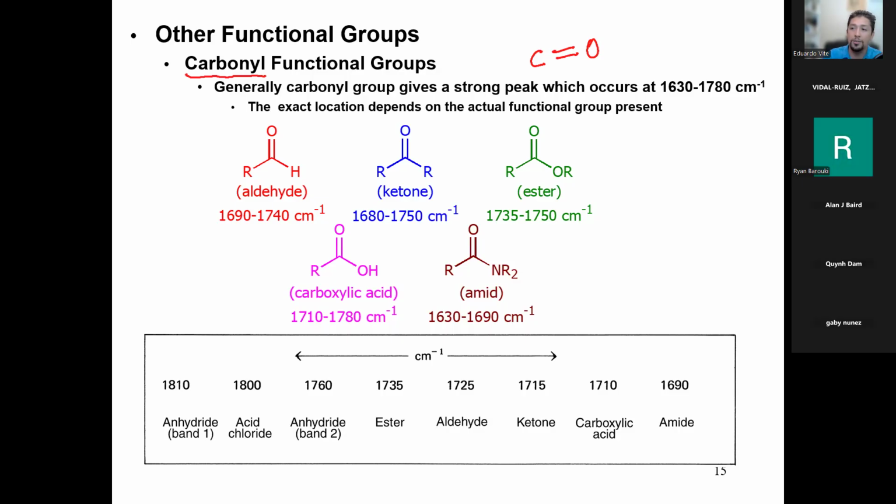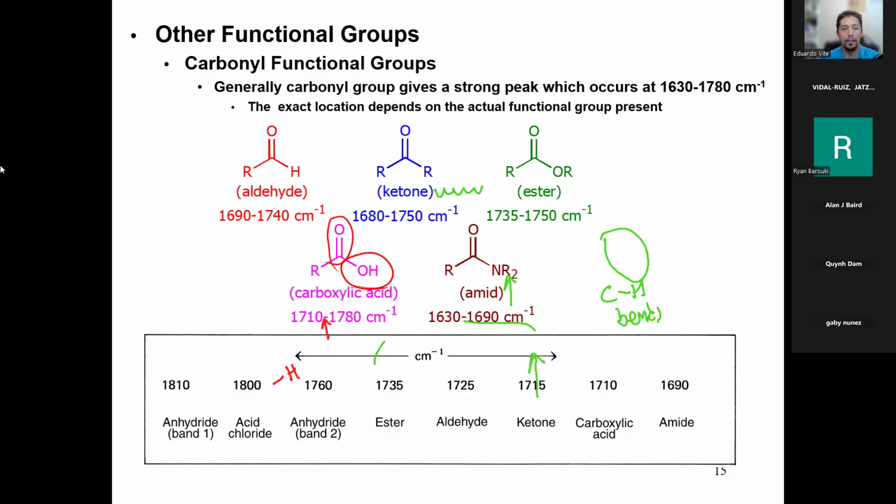If you point to it and you say carboxylic acid, it's wrong because the carboxylic acid has a carbonyl and it has a hydroxyl. Which of the two are you talking about? You have to be specific. One is called hydroxyl, one is called carbonyl. So when you're talking about peaks, you have to use the specific names. This is why you need to know your functional groups. A very common mistake is that people call a carbonyl a carboxylic or a carboxylate. No, that is not true.